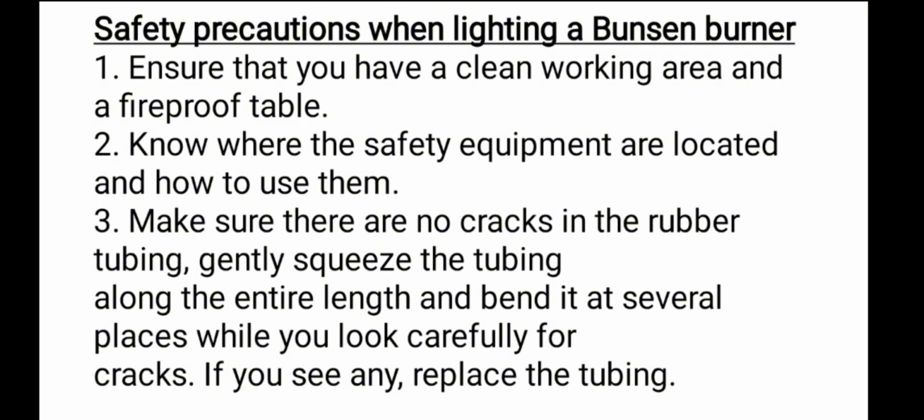This one is very important because in case the rubber tube has a crack, an opening that allows the gas to escape, there is a danger of fire outbreak. You know, gas is highly flammable, and in case it happens, before you know it, the whole building is on fire. So therefore, you have to be very cautious when lighting a Bunsen burner.